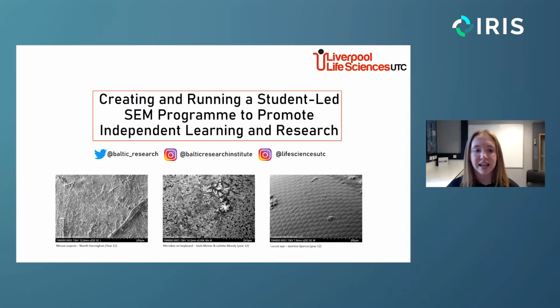So below you can see some of the images that we've obtained from some of the year 12 projects. We can see a mouse scapula, which is just the shoulder blade of a mouse. You can see some artifacts on it, and you can see the paws and dimensions. The second one along is one of our projects figuring out if there are any microbes on surfaces. Obviously, due to the current climate, people are a lot more conscious of cleanliness. So a couple of girls wanted to study that, and you can see what we think is a fungal colony on a keyboard of a computer, but we're not entirely sure.